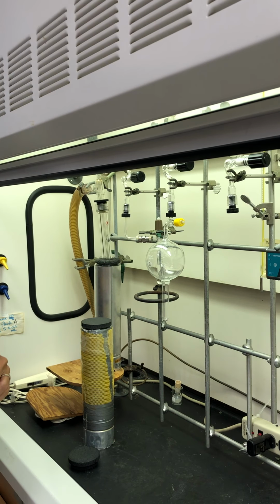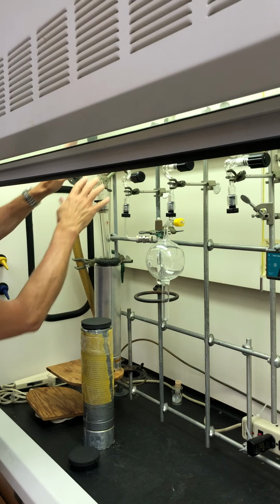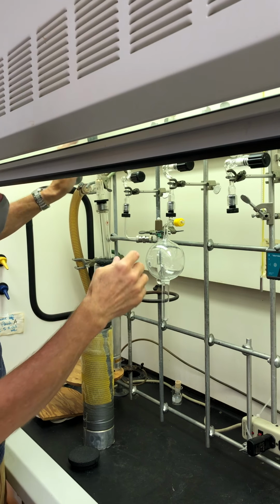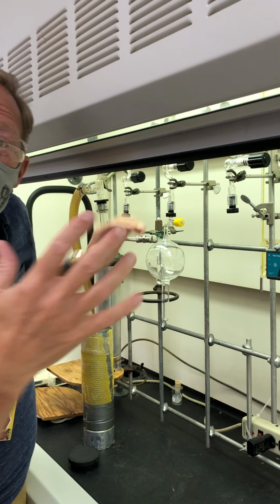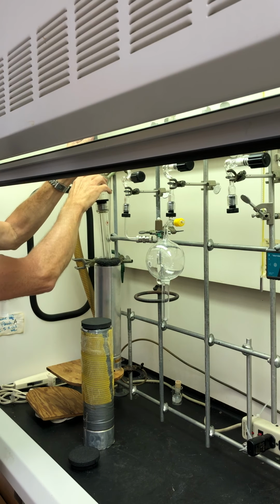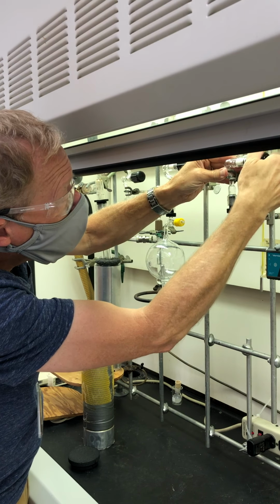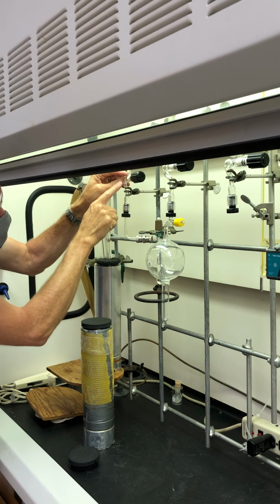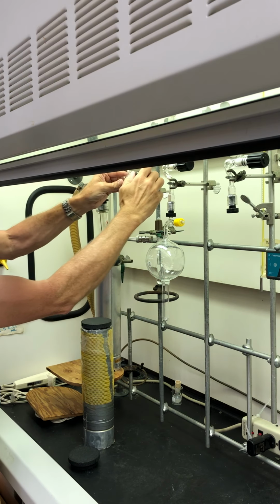One thing I want to demonstrate for you is that we're going to use the two-hand rule for working with valves. This valve right now is closed. In a glass vacuum line, I can always tell that a valve is closed because I can see that the O-ring or the tip of the valve is pressed up against the glass. So here I can see it's pressed up against the glass. To open it, I'm going to make sure I have my other valves closed. This one's closed, this one's closed, this one's open, but it's also sealed off by this sample tube. So I can close it.